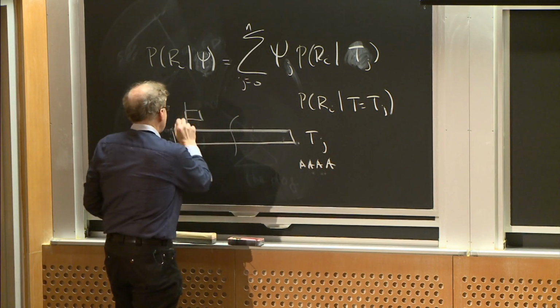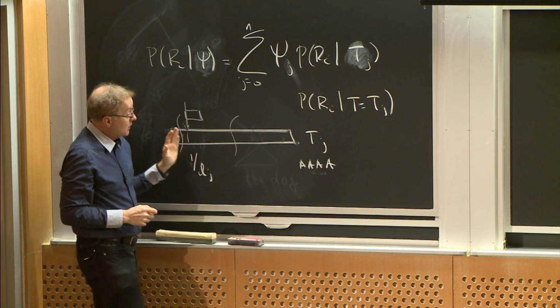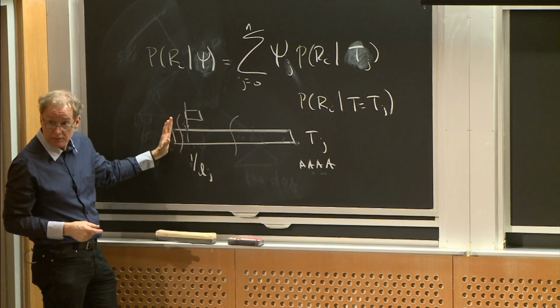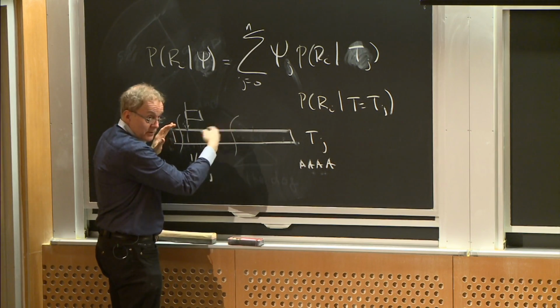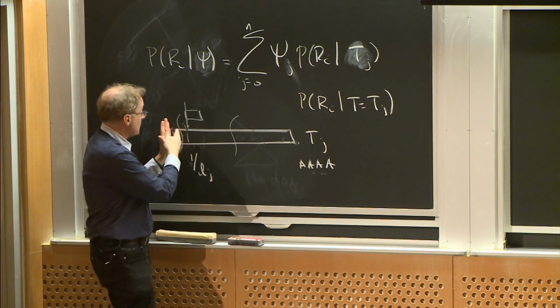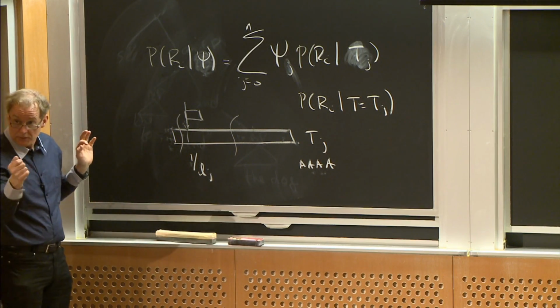And if there's breakage of these transcripts as it goes through the biochemical processing, we can get shorter and shorter molecules. They all contain this bit, and the probability that they contain the whole thing actually decreases. So oftentimes there is 3' bias in RNA-seq experiments that one needs to be mindful of. But we're assuming today that there isn't such bias and that the probability is equal that it maps someplace in this transcript. Okay? Does that answer your question?